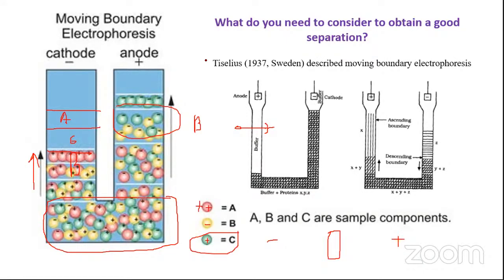We talked about this. If there is more friction, then what happens? Yes? Anyone? More friction leads to heat, right? There is more heat production. Now, the opposite motion is actually going to create more friction, which is basically more heat production. So the apparatus will start to heat up.